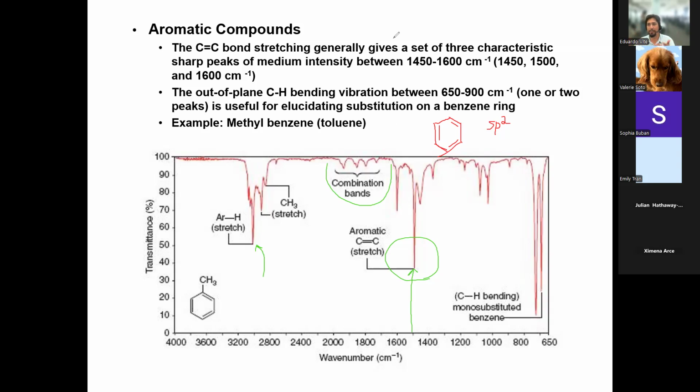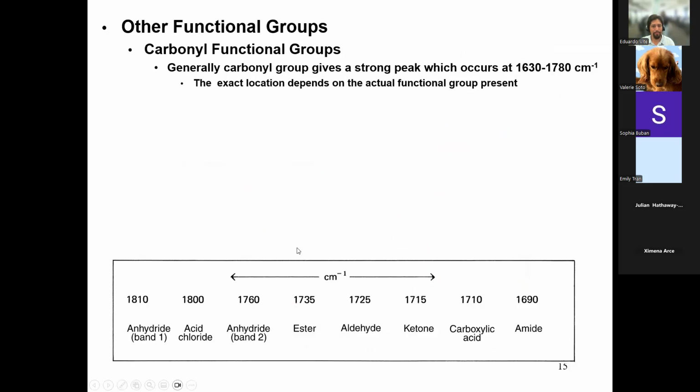And again, these are all carbon hydrogen compounds. So hydrocarbons, right? Nothing else attached to them. We can already get some information out of it. So any questions about any of this? Alrighty, moving on to the next slide.